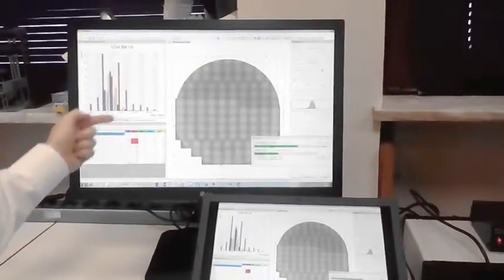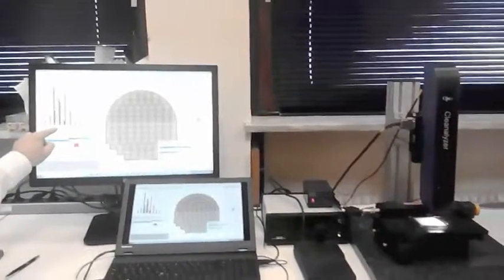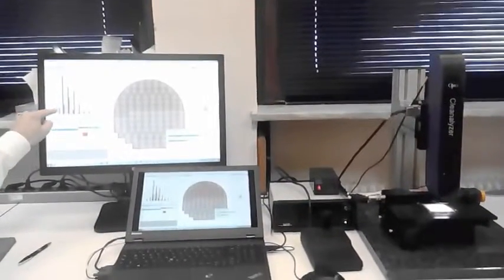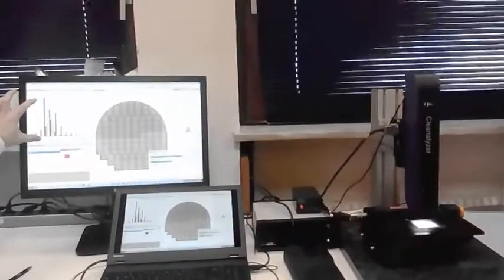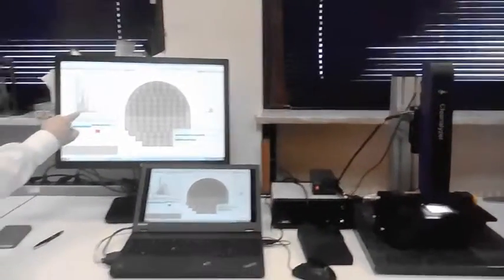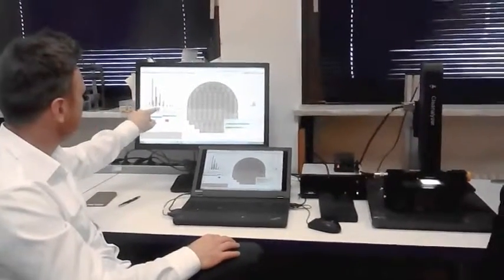So what do we see here already? We've got a failure straight away on VDA BD19. On the 25 to 50 micron counts, we've way exceeded that. So this would be a failure straight away. It's really working very, very well. Also now you can see that we've got a class failure here also, and a bit of a population appearing on 100 to 150.